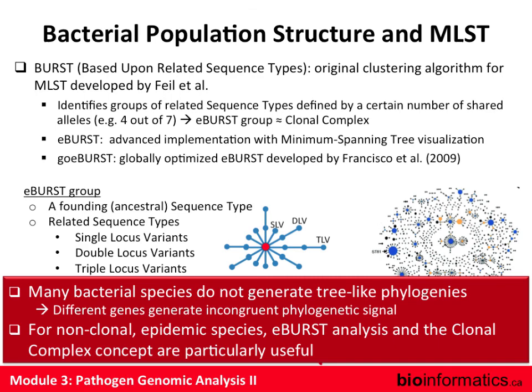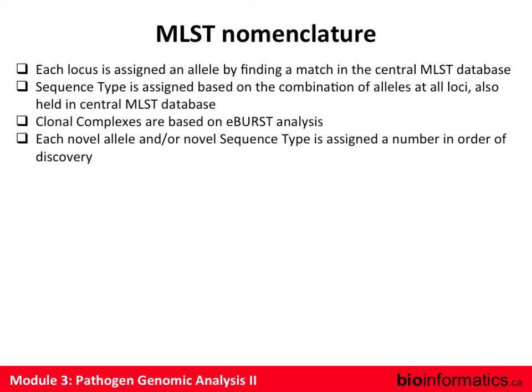So first, just a couple of housekeeping rules for nomenclature of MLST.